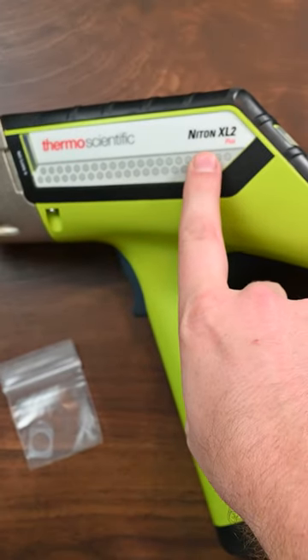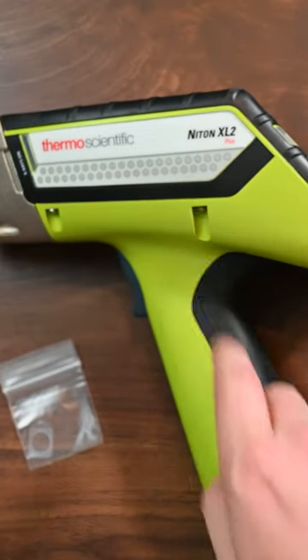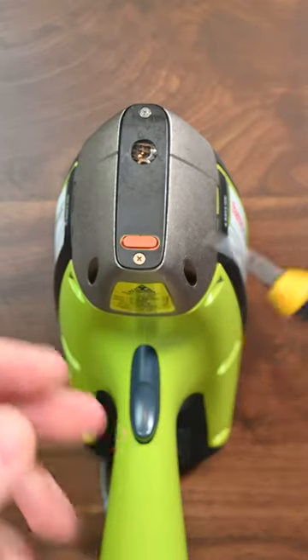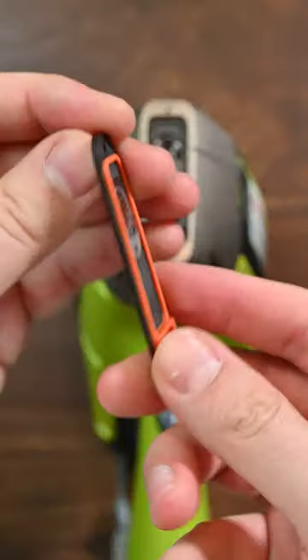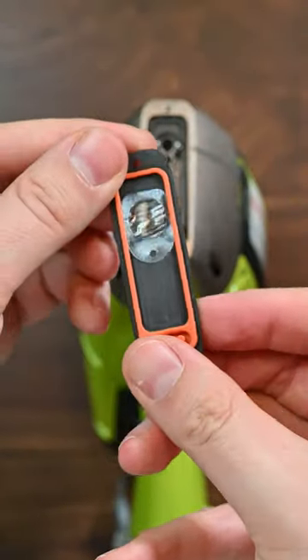How to change the window on the Niton XL2 Plus Analyzer. The process is the same as the XL2. You just remove these front two screws here. On the back side of the face plate, you'll see where the window is.